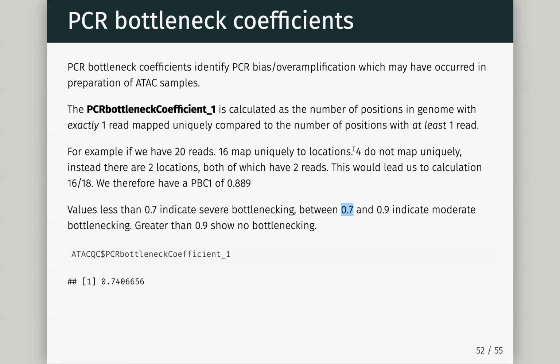If you imagine you have a 36 base pair read on each strand, it means the maximum height you could have before you're a duplicate is 72. Limiting the maximum range of your signal became a real problem for differential ATAC-seq and differential ChIP-seq. You just have a max, and then another one's still the max, but it's actually way higher since we removed duplicates. So there's not much you can do to clean it up, but if you had a sample which fell below this, I would start to think about rerunning that sample.